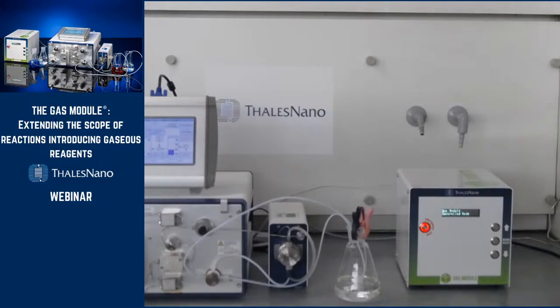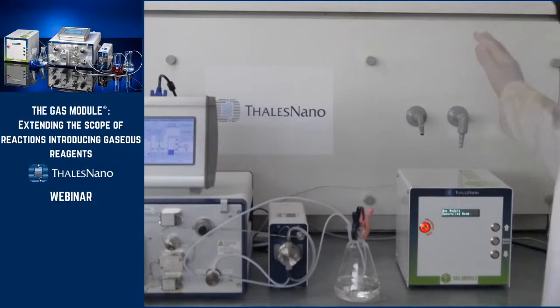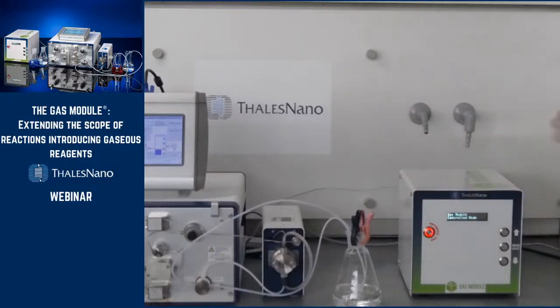You must have a reducer at your cylinder because the gas module can go up to 140 bars from the cylinder. Then your gas inside the gas module passes through the mass flow controller, which allows you to play between 0 and 100 normal milliliters per minute of flow rate.